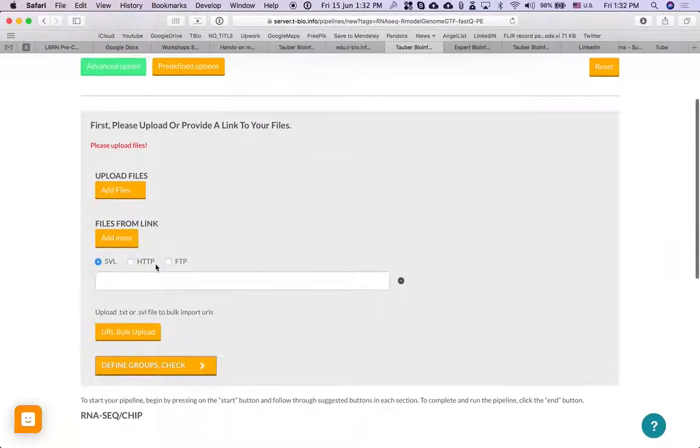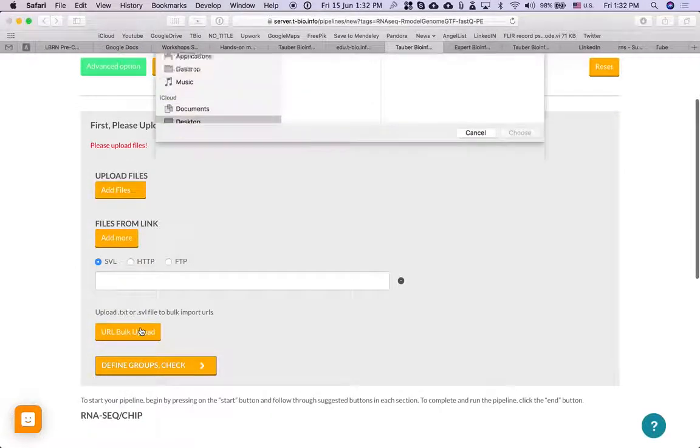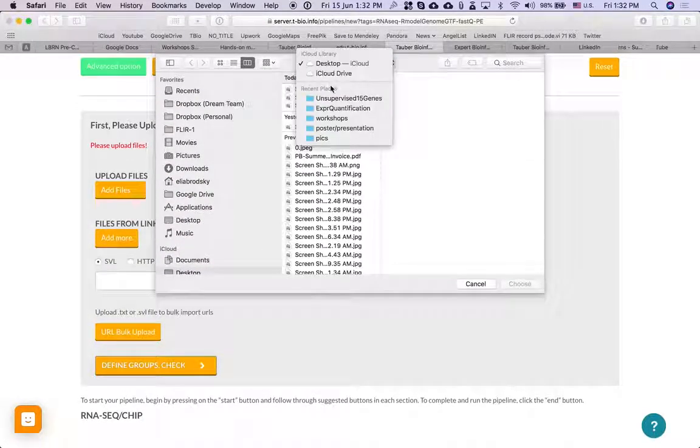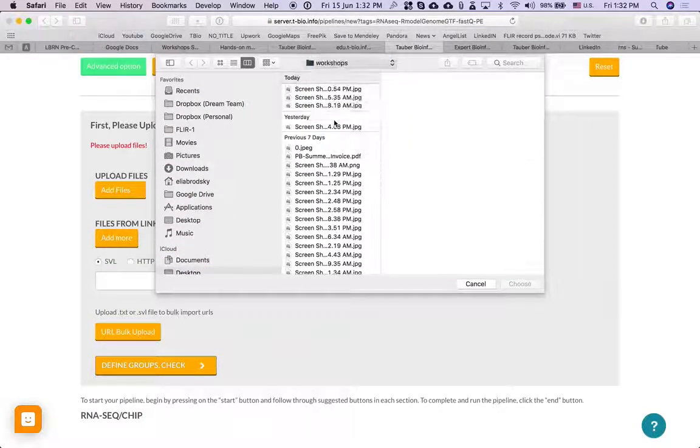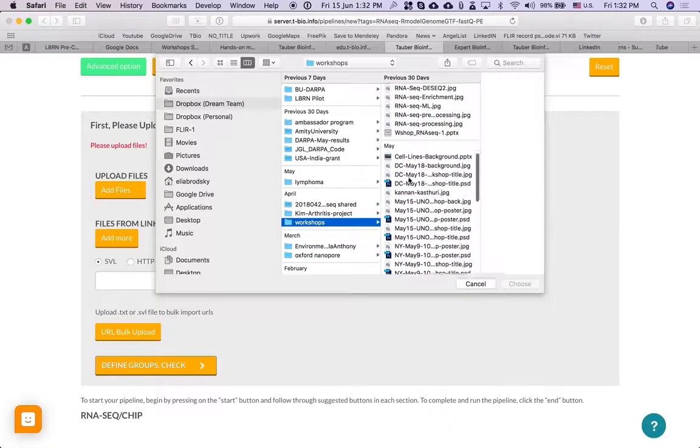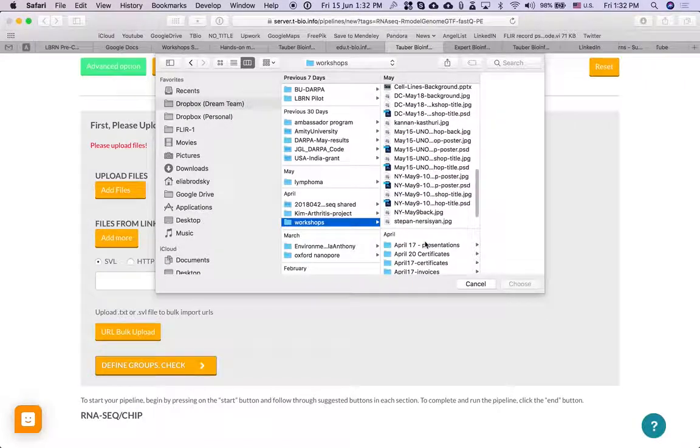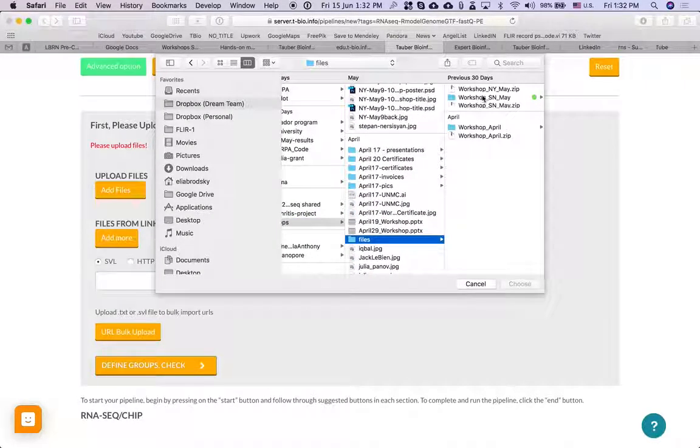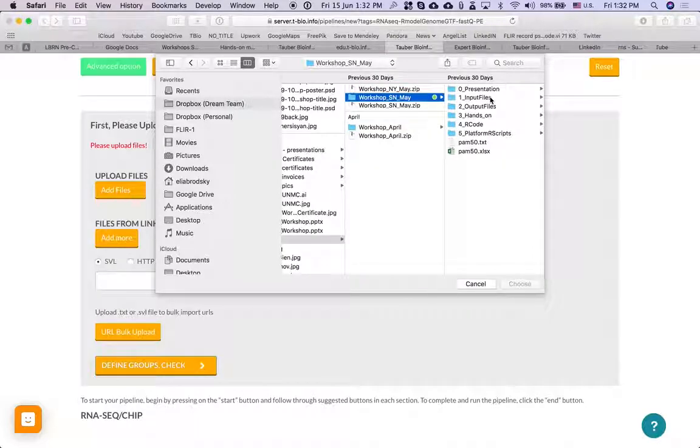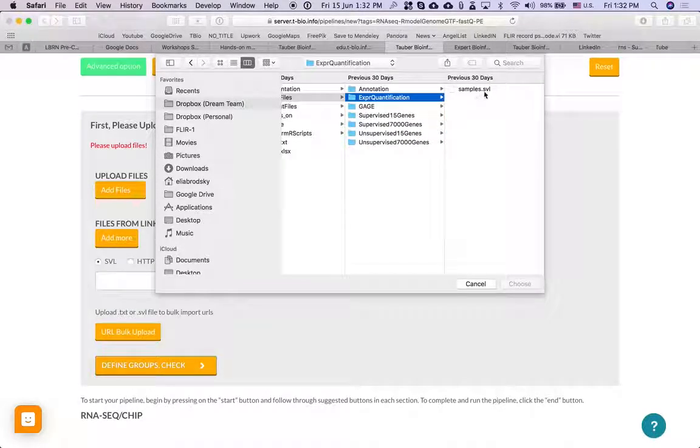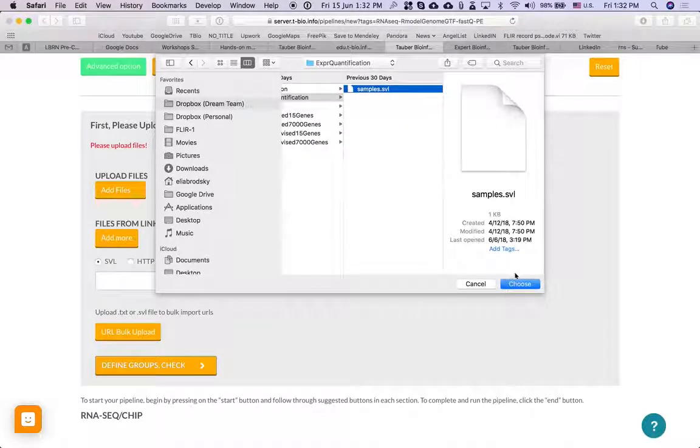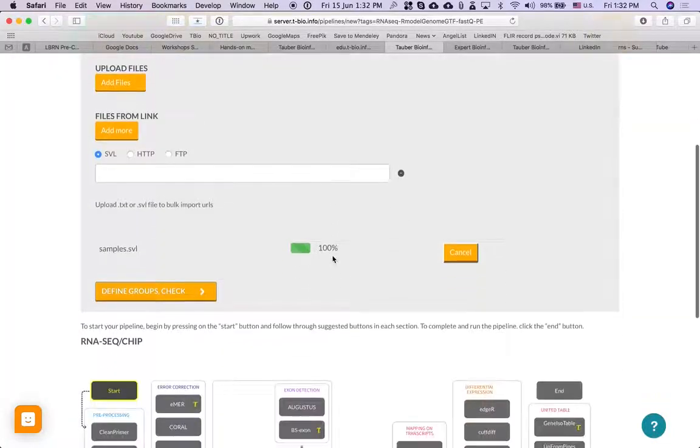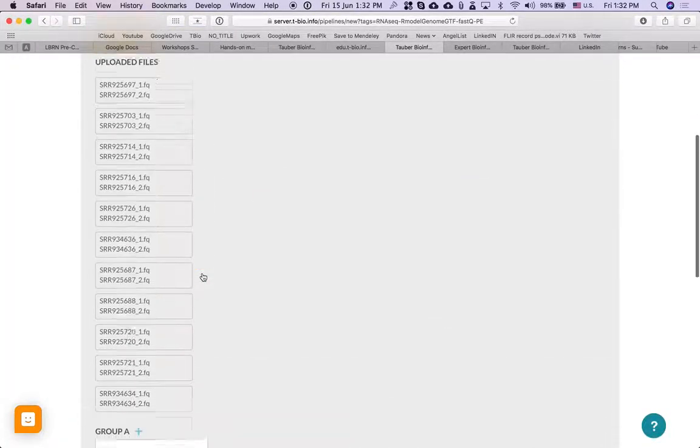I'm going to upload some files. I already have some uploaded files, so I'm just going to go to... okay, and find some input files. Expression, okay. So here are some files already uploaded on the server.